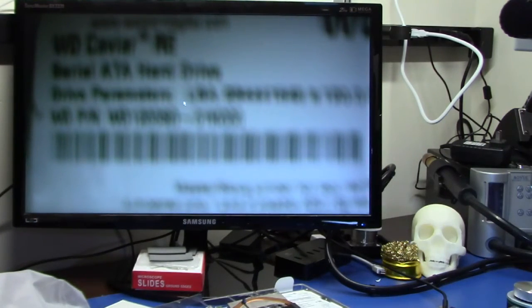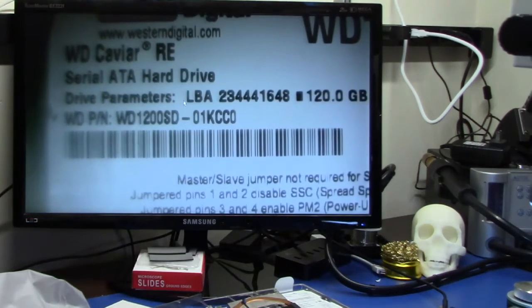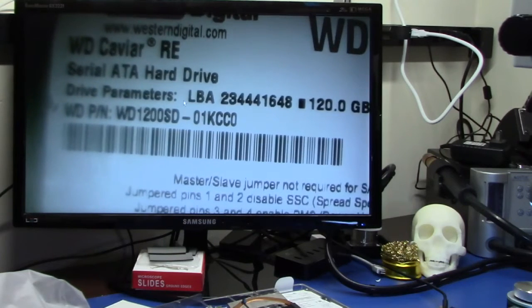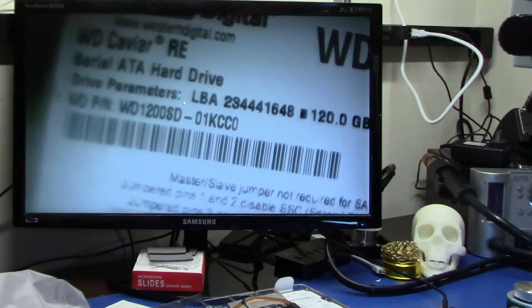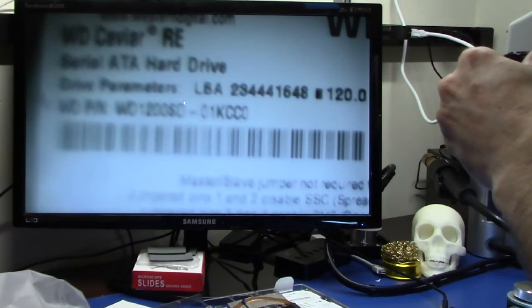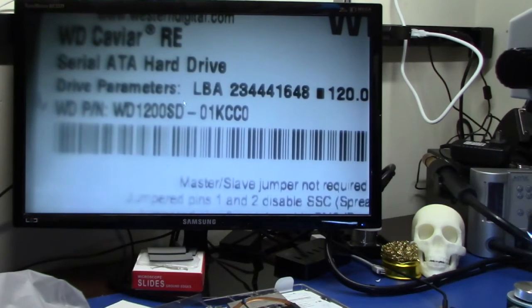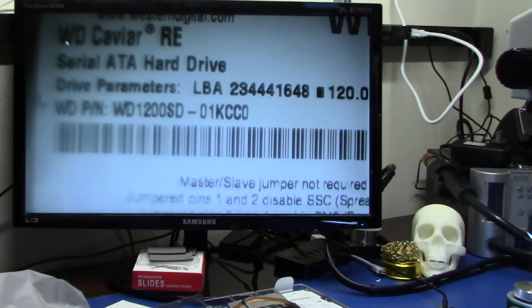Drop that into the camera. The object is to get the same — let's see if I can get focus. I'm in focus, but it's not quite right, so that means that's more of a ring adjustment. Let's see if we can move the hard drive slightly to get that same image. The camera keeps turning on me. I'm all the way zoomed out. You'll notice over here the barcode starting off at the zero. Up here, WD in the far left-hand corner. The difference is we have a little bit more area of capture on the left side now because of the wider lens, from the 050 to the 037.